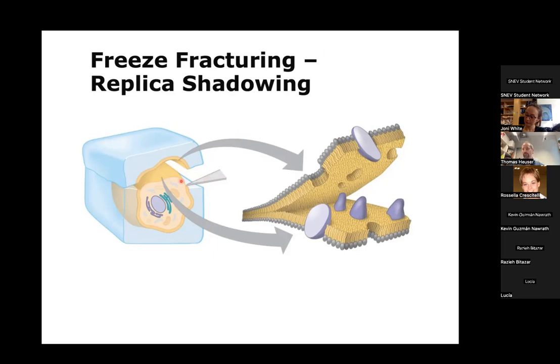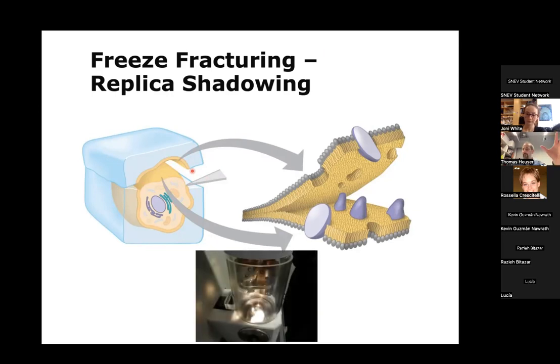So this could be, for example, just near the membrane, where we think some extracellular vesicles are about to be released. And then you get these two halves: you have your metal plate connected by a lever, you crack it open, and now you have your sample in two halves. This part was basically, we just took the sample and froze it. This is basically pure cryo-EM. And now comes the conventional part, which makes it all together a hybrid method.